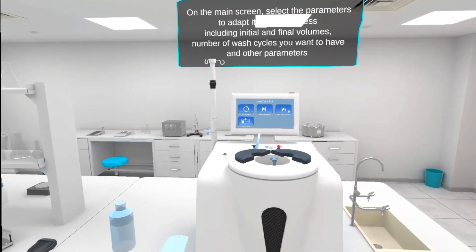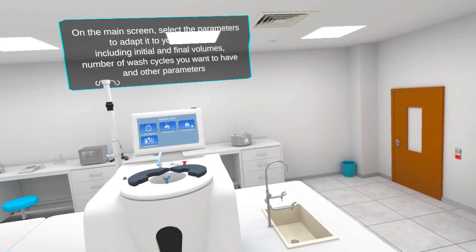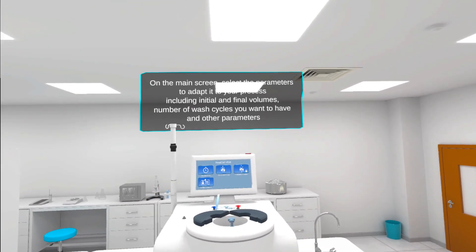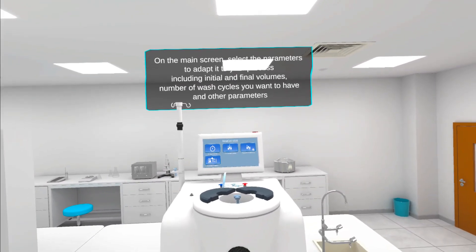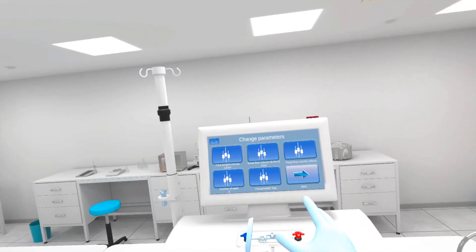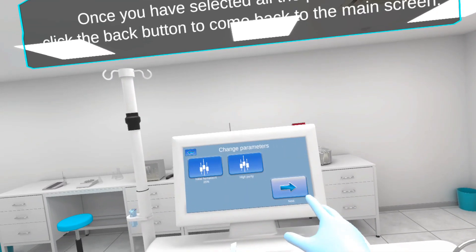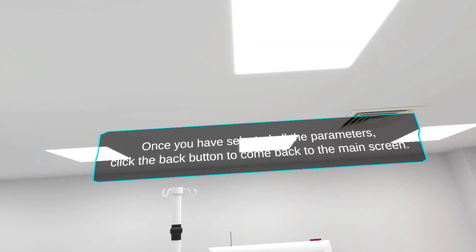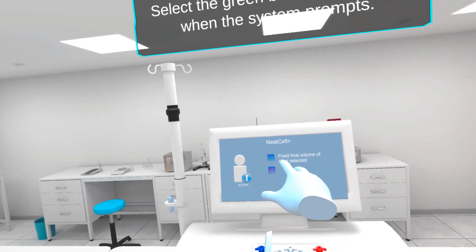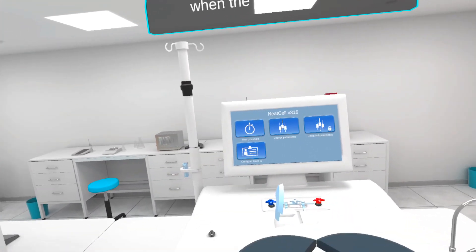On the main screen, select the parameters to adapt it to your process, including initial and final volumes, number of wash cycles you want to have, and other parameters. Once you have selected all the parameters, click the back button to come back to the main screen. Select the green button to continue when the system prompts.